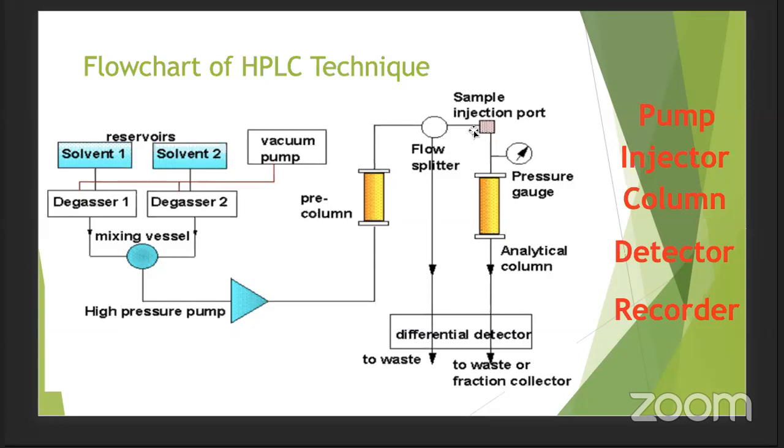The third one, the most modern injector you can say, is the micro volume sampling injector. This is basically a high accuracy injector, and it uses loop injection. You fill the loop before starting the experiment, and then you start the experiment, and just by changing the loop or the direction of the flow, you auto inject the sample or the component that you want to isolate.